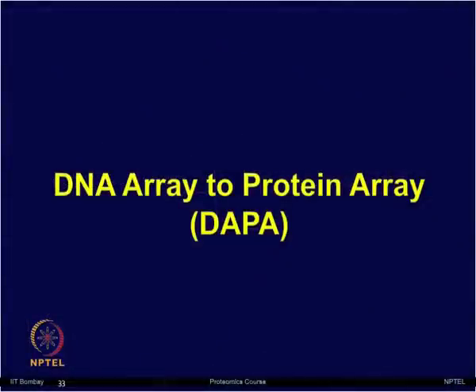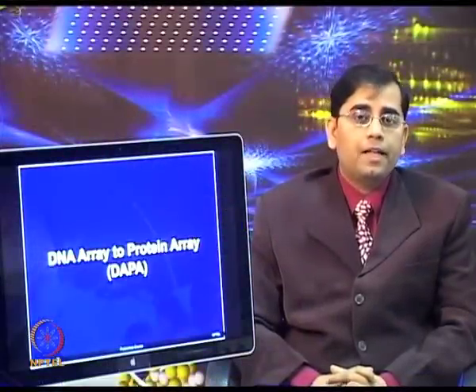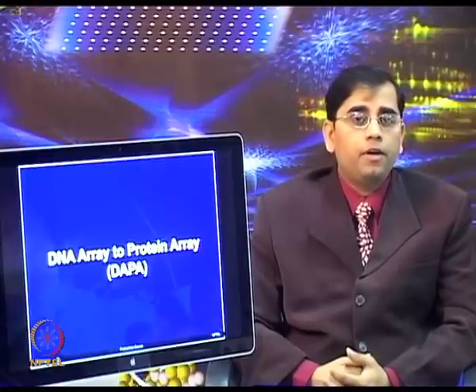Let us now move on to DNA arrays to protein arrays, or DAPA. The DAPA technique makes possible the repeated use of the same DNA template slide for printing multiple rounds of protein arrays.